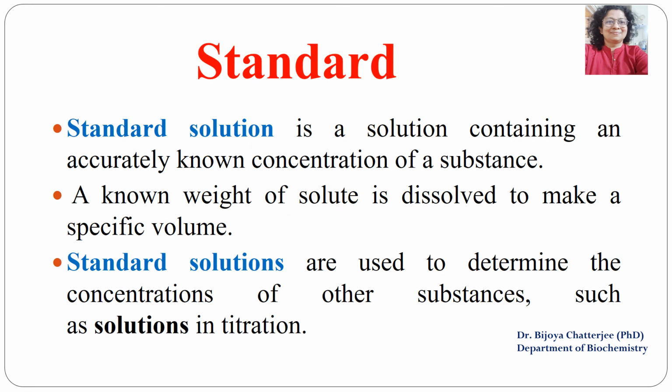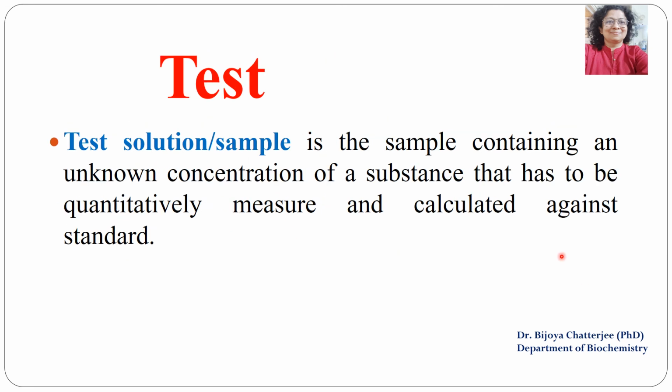We have prepared it. Now, what is a test sample? A test sample is a sample containing an unknown concentration of a substance that has to be quantitatively measured and calculated against a standard having a known value of the same substance.